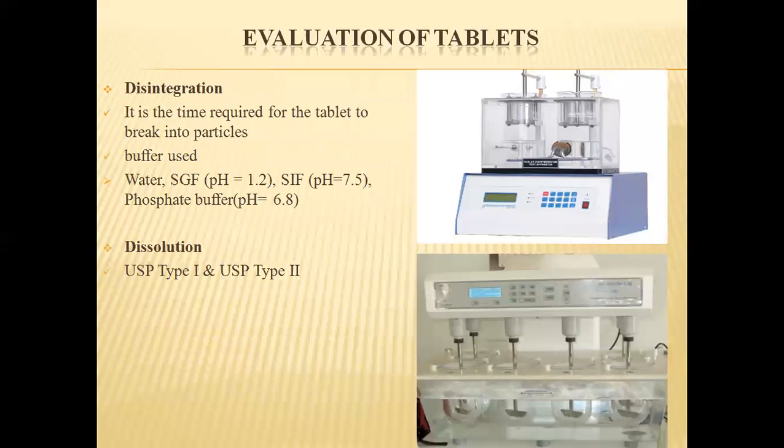Then, disintegration test for tablet. Disintegration time can be known as the time required to break down the tablet after swallowing. The rate of disintegration depends on the type of the tablet. The tablets which are dissolved by slow solution in mouth, or chewed, or are to be dissolved in water before administration do not need a disintegration test.